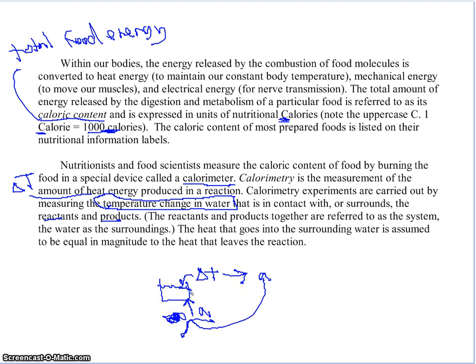You should write a procedure before coming into class based on the materials on this page. You should have an idea of how you're going to do this. How are you going to figure out the calories in a Cheeto? Bum, bum, bum.